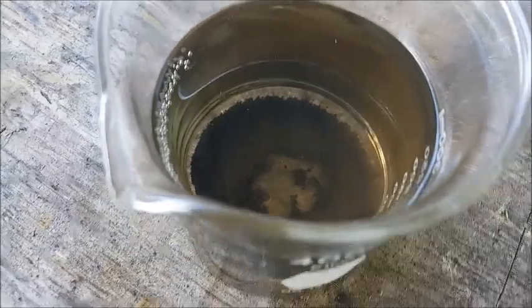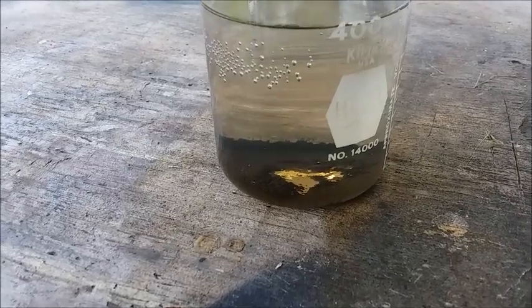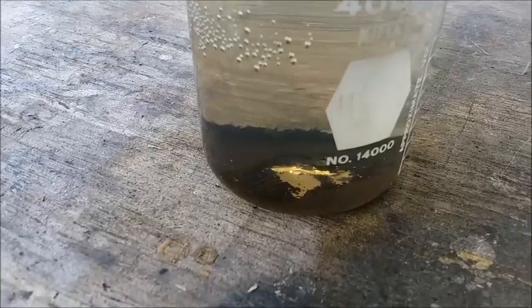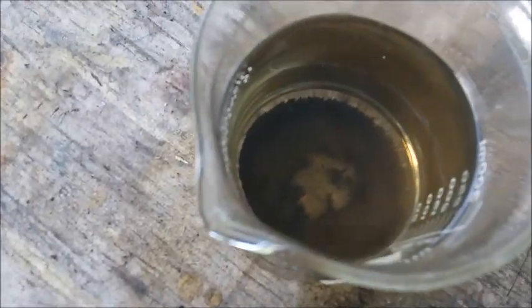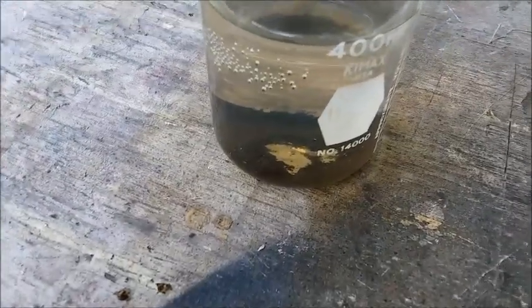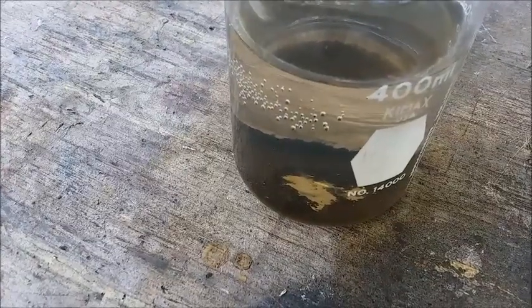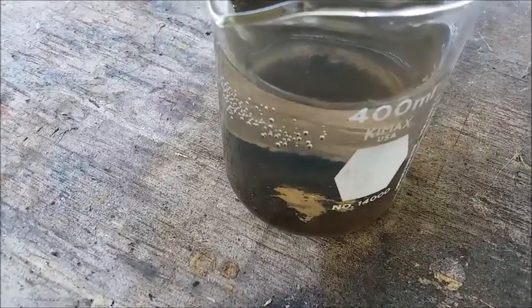So here we are. Got a nice thick pile of gold on the bottom of this beaker. And the liquid above the gold is pretty darn clear and colorless, with a slight gray tint to it. I should check it with stannous chloride solution to make sure all the gold has come out of solution, but it's looking pretty good. Yeah, that layer of gold on the bottom is a lot thicker than I thought. It was just a light dusting at first, but it's a pretty thick layer once I swirled it around a bit. So I will get this gold cleaned up, dried up, and weighed up, and I'll show you what I got.